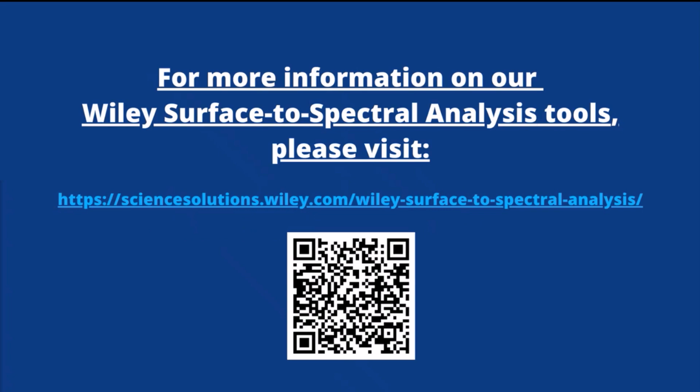How about this first one? This is a great product. Is there a trial available to be able to test out? Yes, there is a free trial that's good for 3 days. And in order to get it, you would need to go to our website, sciencesolutions.wiley.com, and click on Learn More. You can be put into contact with someone who can help you get started with the free trial.